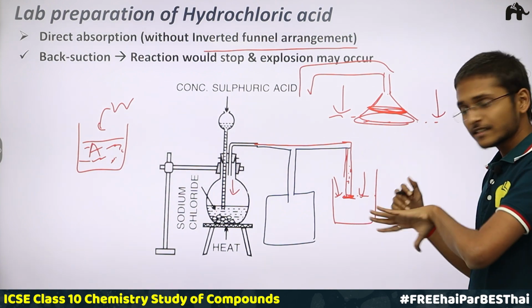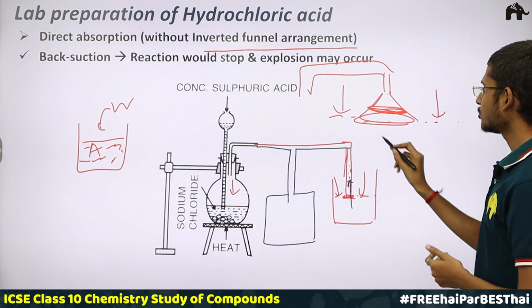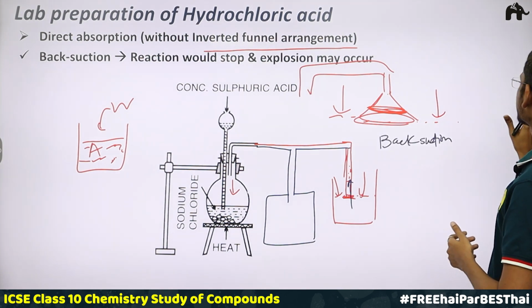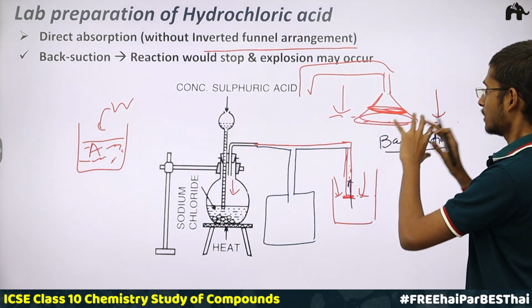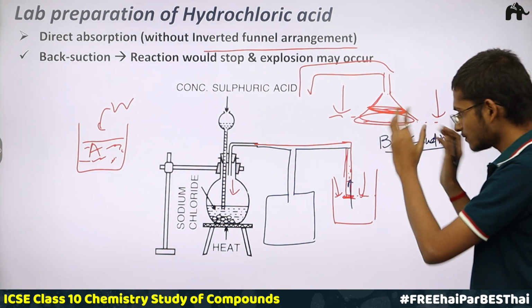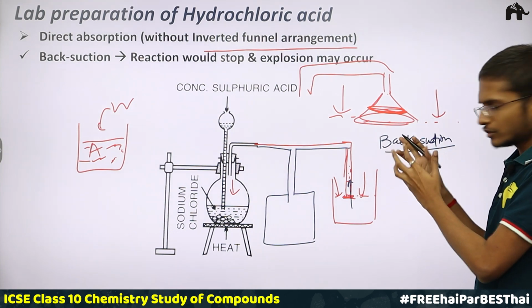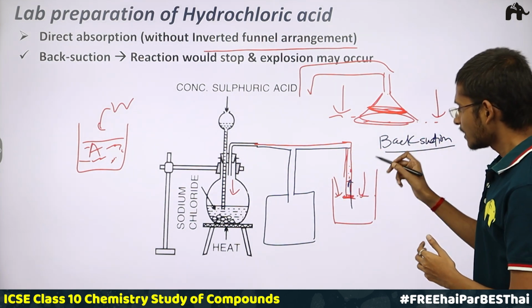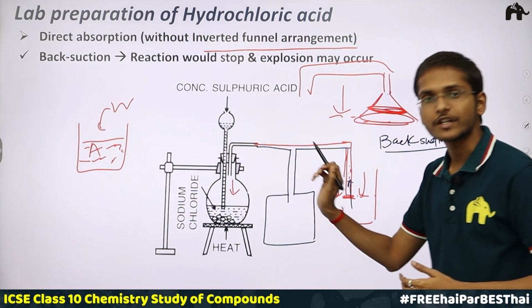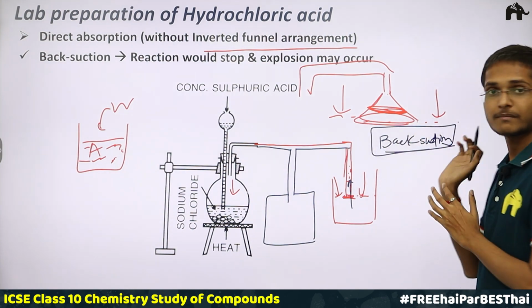So in case this back suction occurs, which I have told you, this entire process is back suction. Back suction means water is entering the delivery tube and it is directly going into the generating flask. This is called back suction. If I would summarize this entire process, it is called back suction.